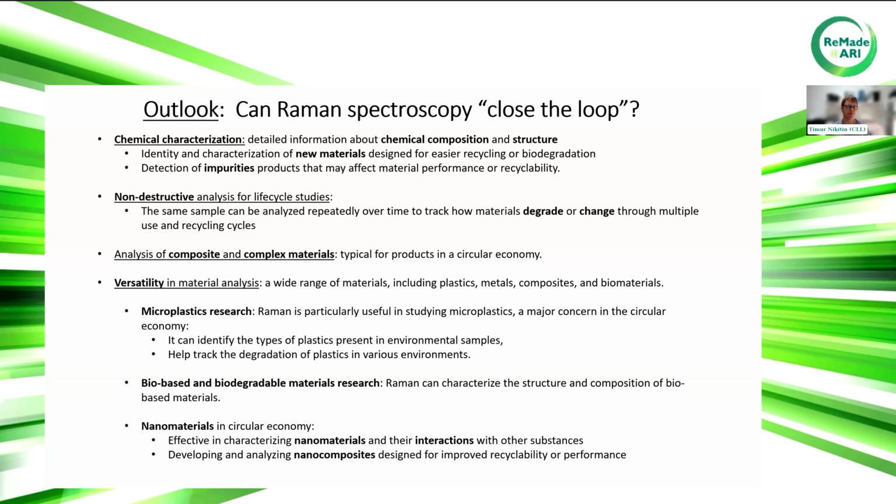In particular, microplastic research can be easily done by Raman spectroscopy. Bio-based and biodegradable materials can also be easily studied. These are all very Raman active. And then, as in the last examples, nanomaterials are important in the circular economy and can be studied by Raman spectroscopy. This method is effective in characterizing nanomaterials and their interactions, and developing or analyzing nanocomposites would also be important for the circular economy, and this can also be studied by Raman spectroscopy.